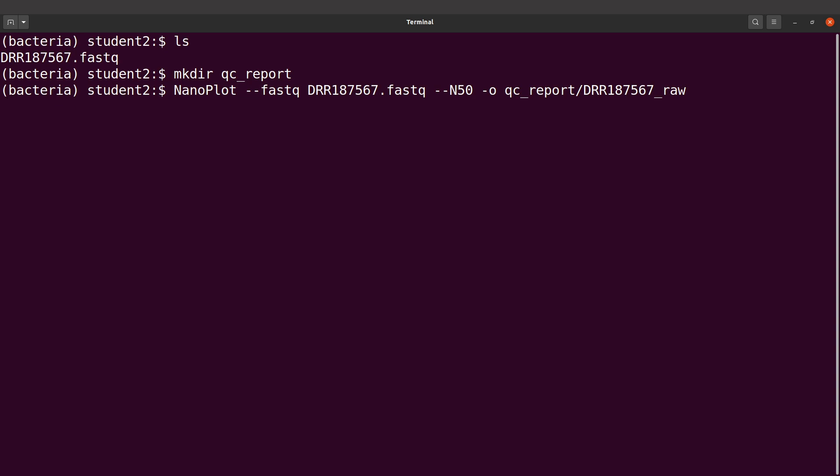This command took about one minute to execute, so you should also monitor the time — it will take around the same time to complete. Let's wait for everything to get done.